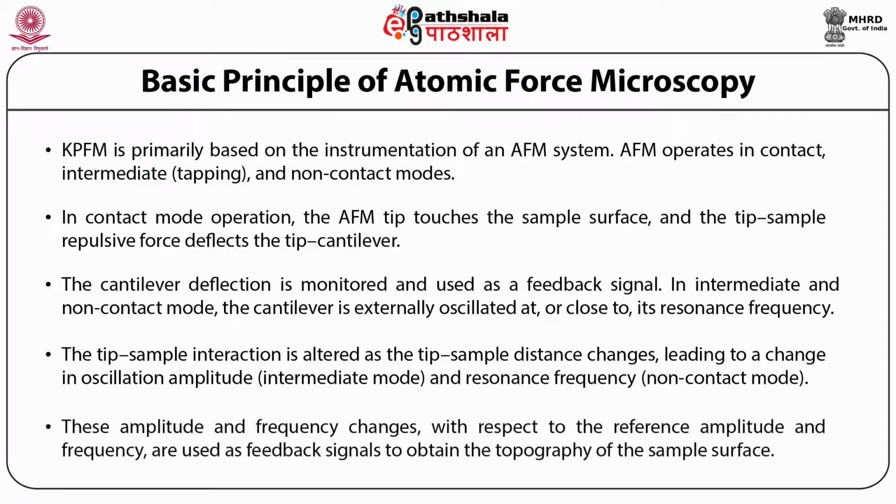These amplitude and frequency changes with respect to the reference amplitude and frequency are used as feedback signals to obtain the topography of the sample surface. Therefore, intermediate mode and non-contact mode are referred to as amplitude modulation AM and frequency modulation FM operations respectively.